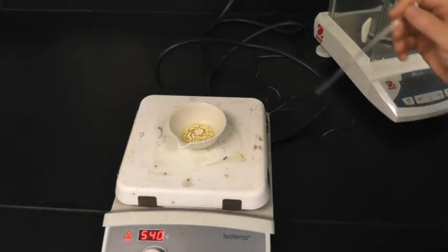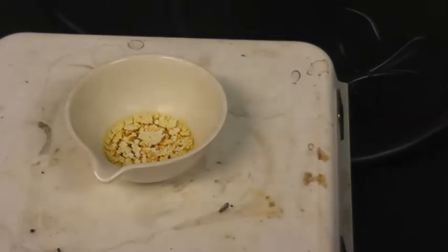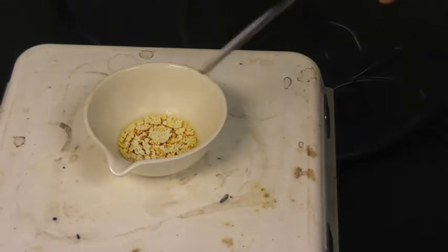All right, so this is after 20 minutes of heating, and you can see that it's a white crust on top and red underneath. It's kind of like the planet of Crait in episode 8 of Star Wars, where you have those speeders going across and it's throwing up red dirt.